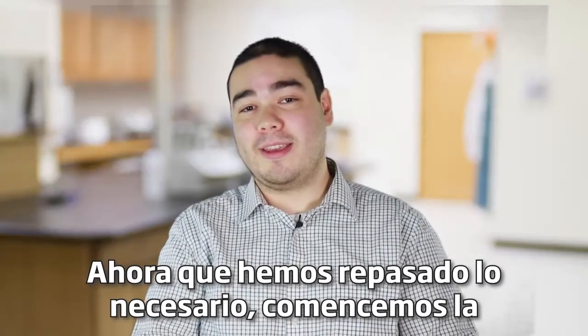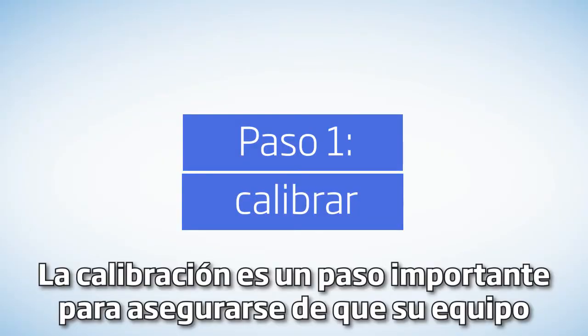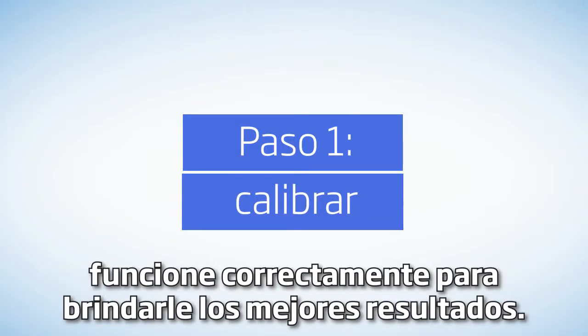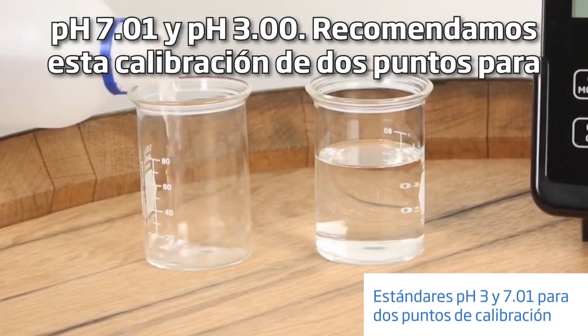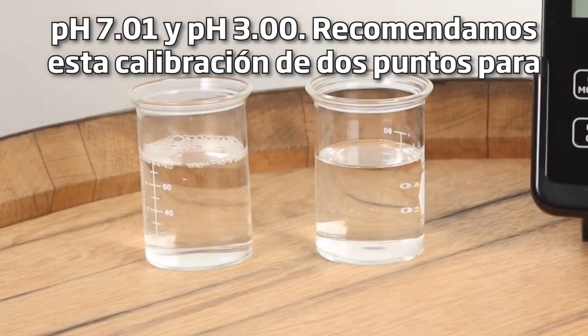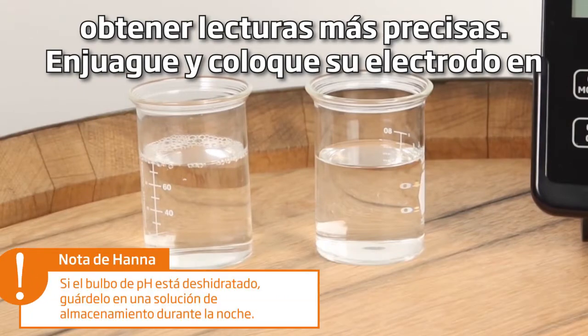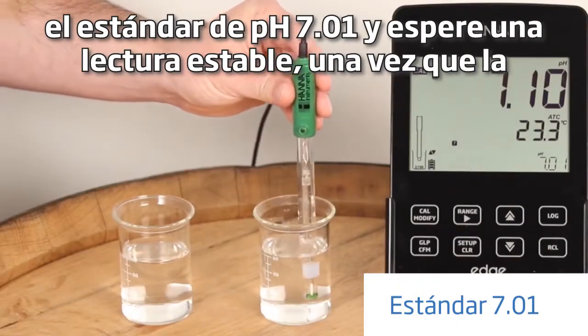Now that we've gone over the kit let's open it up and start with calibration. Calibration is an important step in making sure your equipment is working properly to give you the best results. To calibrate your meter, first fill your beakers with pH 7.01 and pH 3 buffers. We recommend this two-point calibration for more accurate readings. Rinse and place your electrode in the pH 7.01 buffer and wait for a stable reading.